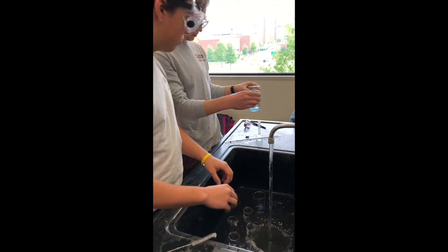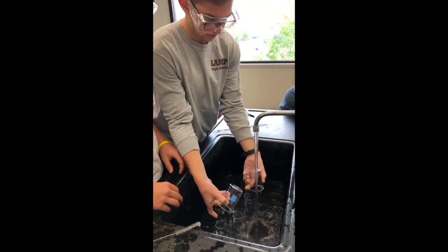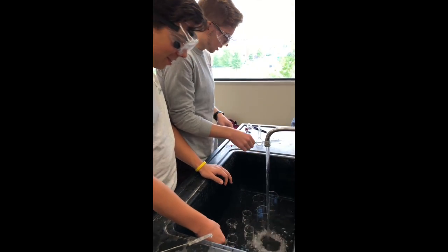At the end of the experiment, students clean up their own stations and dispose of all the solutions properly.